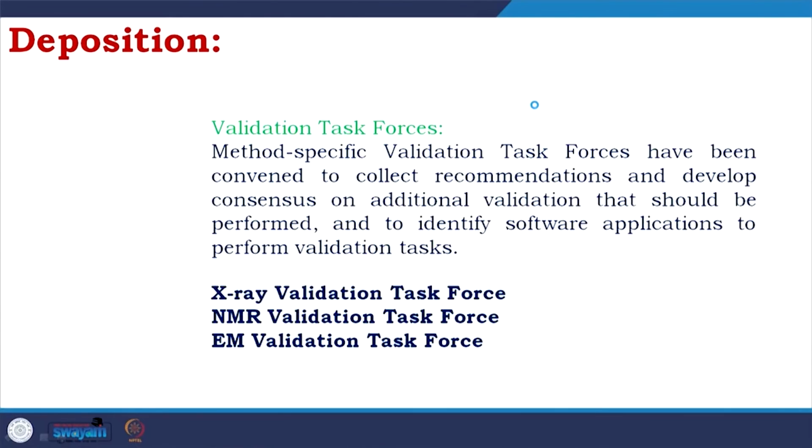So, there are validation task forces: the X-ray validation task force, the NMR validation task force, and the electron microscope validation task force. A crystallographer like me is in the X-ray validation task force, and an NMR specialist is in the NMR validation task force. They look at other factors which the automation programs are not able to detect, and they will send you back to improve those factors.